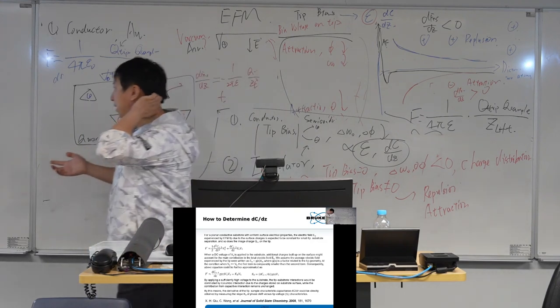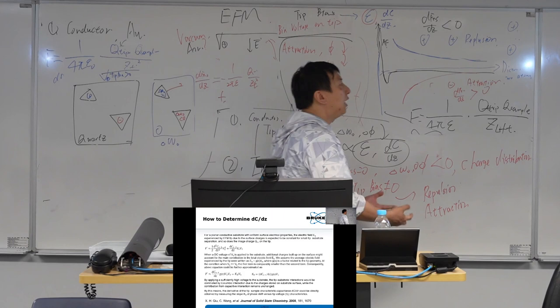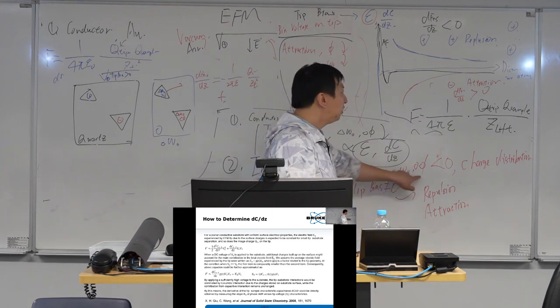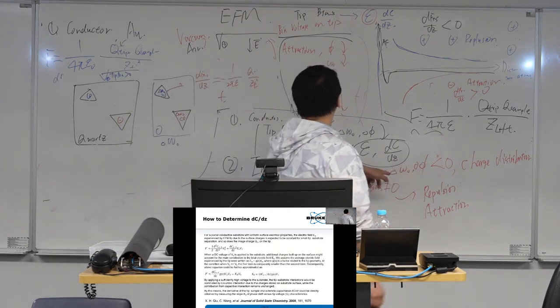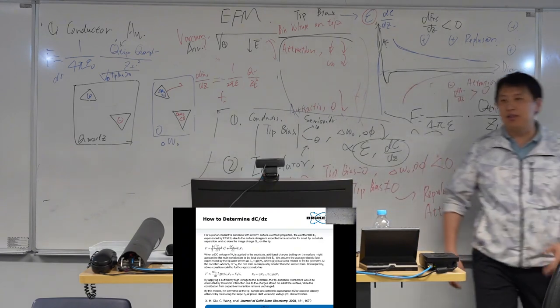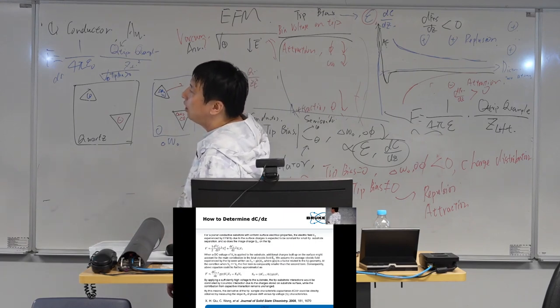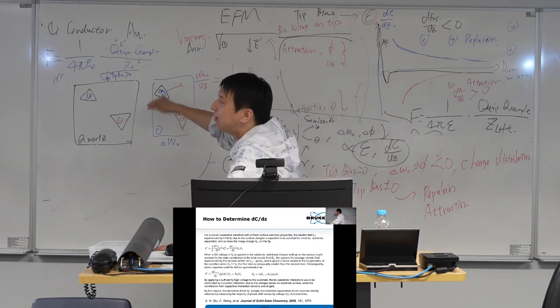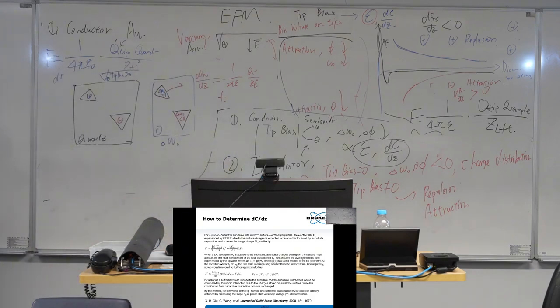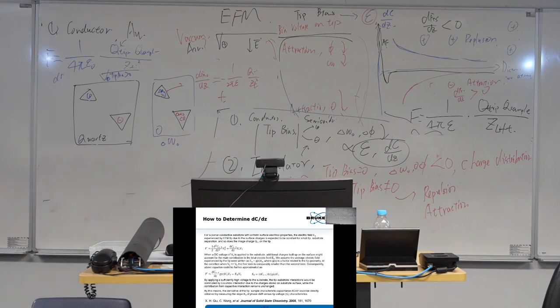Okay. So if you want to do some theoretical study, you get an idea that we are actually getting the frequency shift or the phase shift, and this frequency or phase shift is actually the force gradient, and from the force gradient we need to tell the origin of this force gradient. If the sample is low charge, this force gradient will be proportional to dC over dz. If the sample is charged, this force gradient is proportional to the charge distribution on the sample.